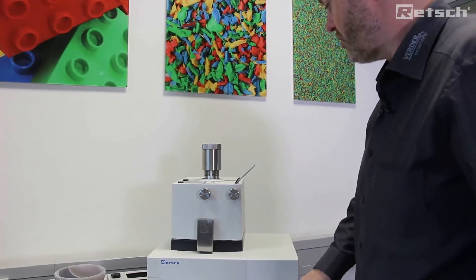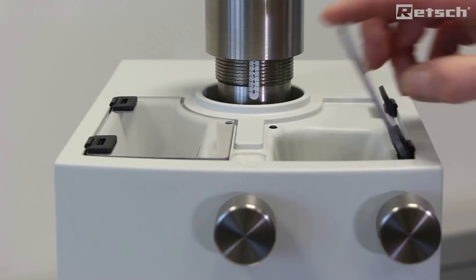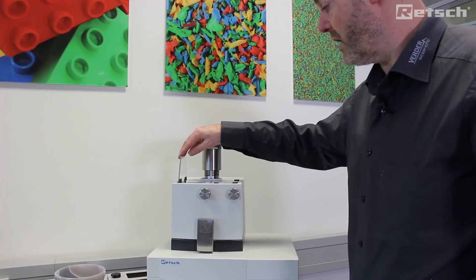We would operate the instrument and pour the sample material in through the right-hand feed window. You will also note there is a left-hand feed window for observing the progress of the sample.